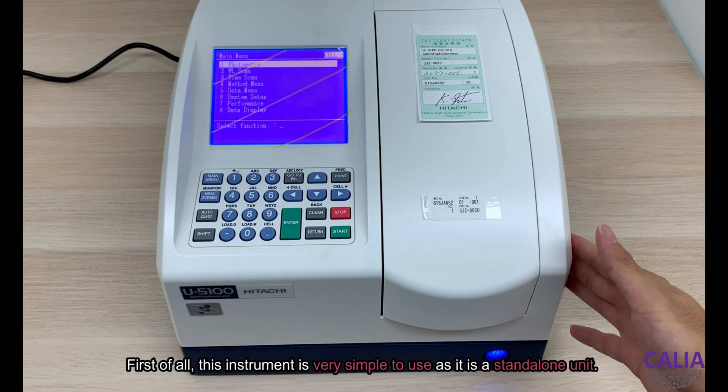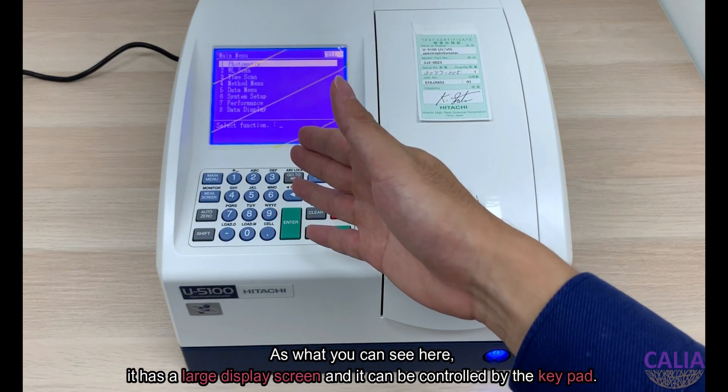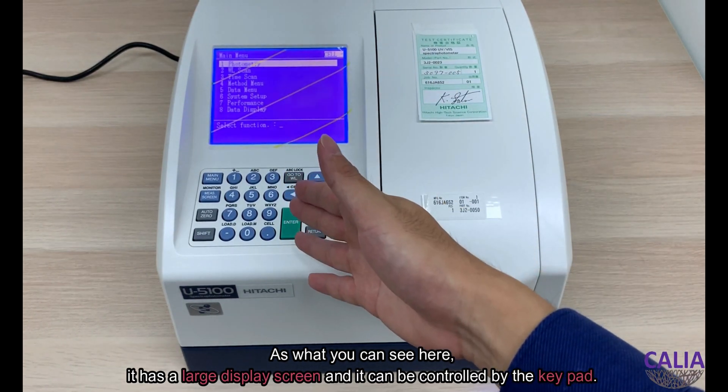First of all, this instrument is very simple to use as it is a standalone unit. As you can see here, it has a large display screen and it can be controlled by keypad.